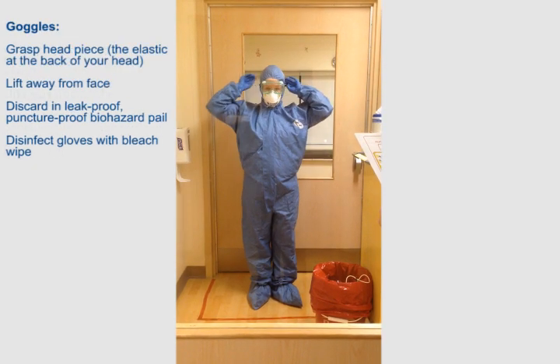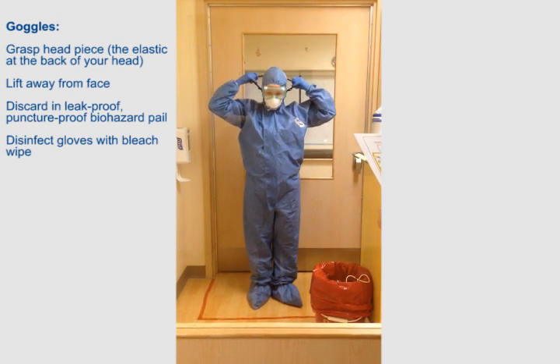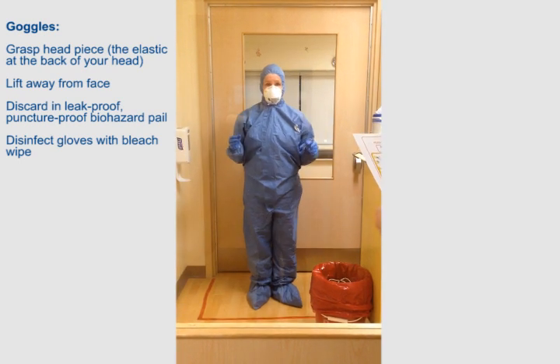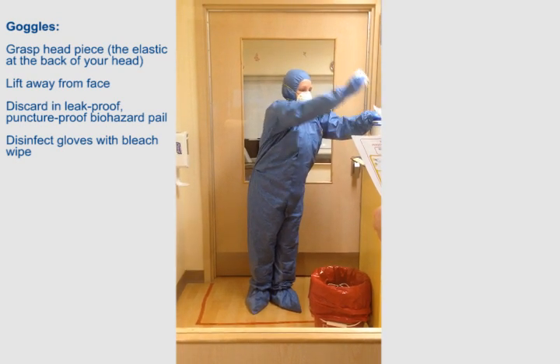Goggles. Grasp headpiece, the elastic at the back of your head. Lift away from face. Discard in leak-proof, puncture-proof biohazard pail. Disinfect gloves with bleach wipe.